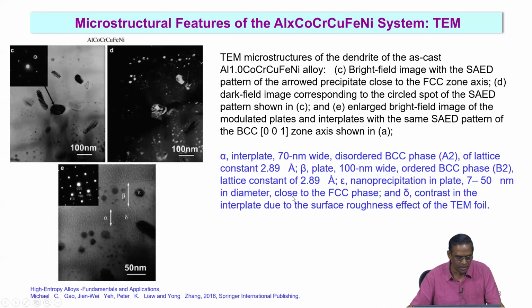Okay, so what you are seeing, of course, with all these contrast mechanisms, is basically because of the diffraction contrast, right? Not any other mechanisms.